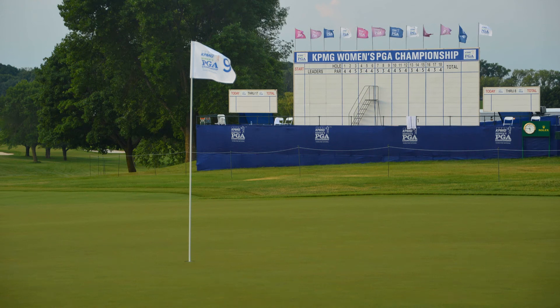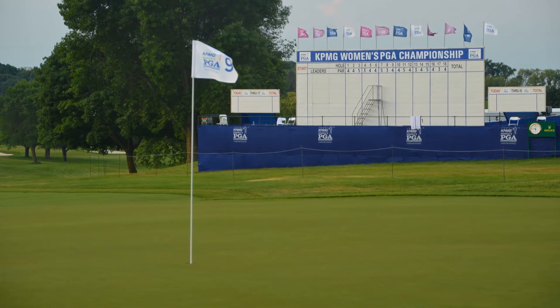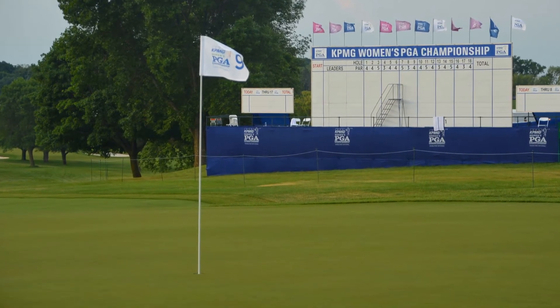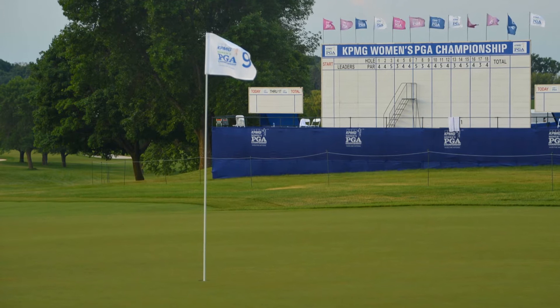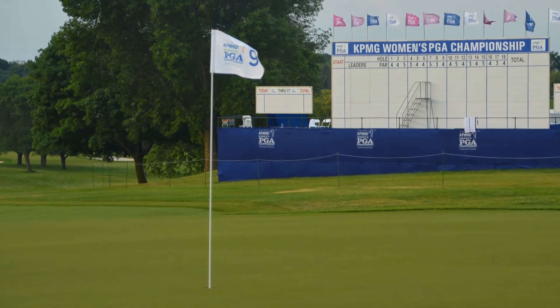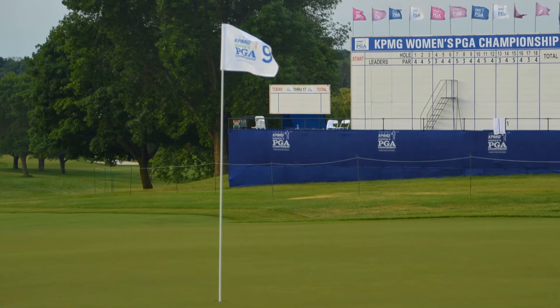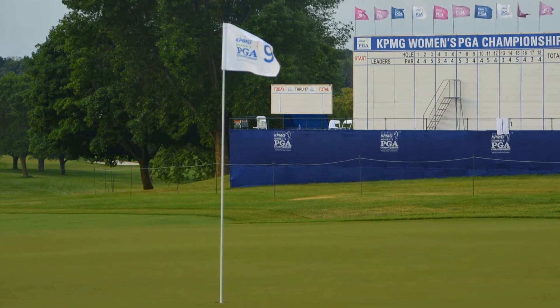This is the 9th green at Hazeltine National Golf Club in Chaska, Minnesota. I'm going to show you what soil samples from this green — the total organic material by depth, what I call the OM246 samples — looked like after they were burned in a muffle furnace at 440 degrees Celsius.